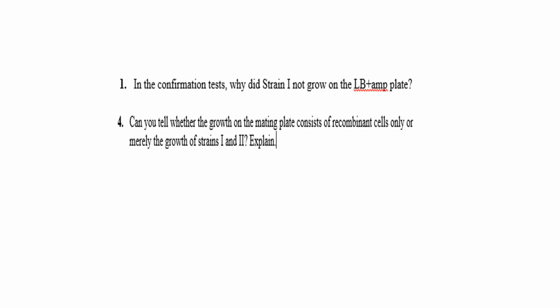For example, question 1 reads, in the confirmation test, why did strain 1 not grow on the LB plus AMP plate? You should read the question carefully and make sure you understand what you're being asked. When answering these questions, you need to be very explanatory and give the theoretical reasonings for your answers.